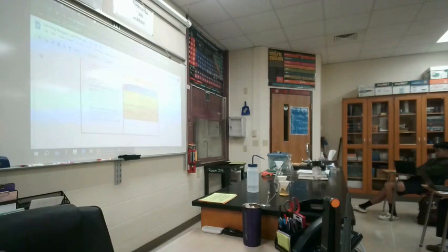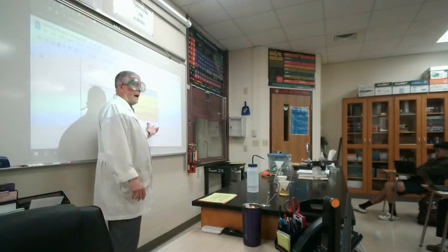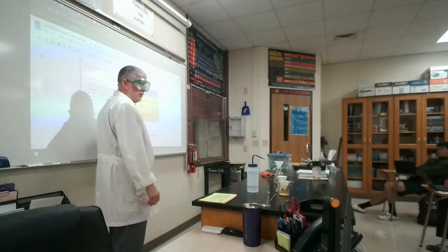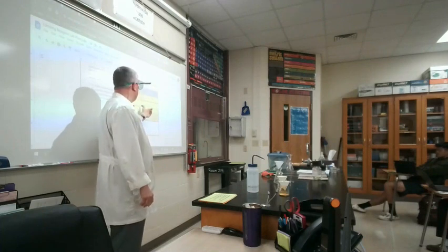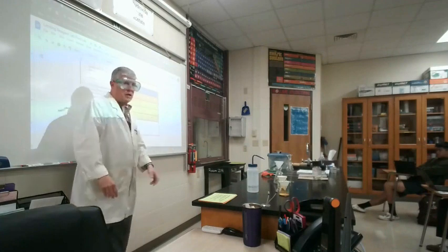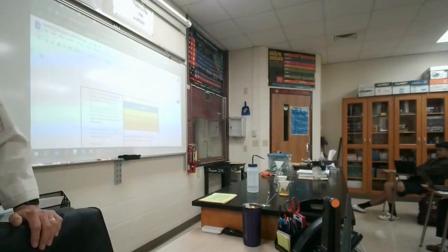The wet PbI2 is the solid stuff that is down in the bottom of the container. You will describe it. The reaction is when you mix the two solutions together. The wet PbI2 is the stuff that is in the bottom afterwards. You cannot do the dry PbI2 until tomorrow.